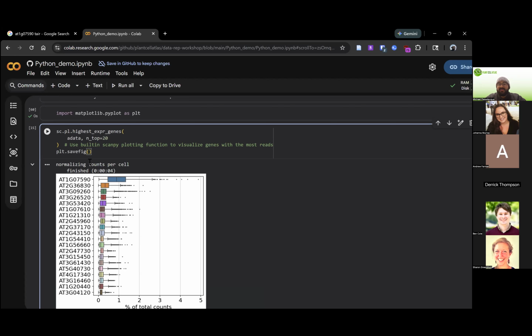So we have a couple more Q&A questions. How do we decide what genome assembly we should use? For most species, by default, I would go to NCBI and pick the reference genome from there. If you have your own genotype and you have a genome for it, you might want to use that. This can get tricky for a couple of species like maize, where there are a couple of different versions that have different pros and minuses. I know a lot of people for maize are still on V3 instead of V4 or V5, which is what we're up to now. So that can be quite tricky.